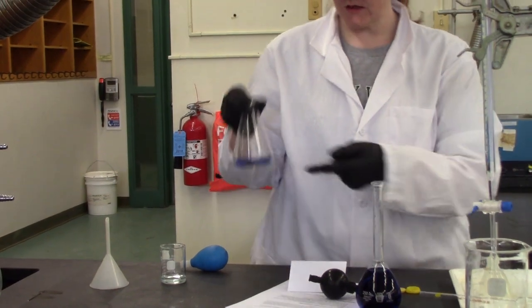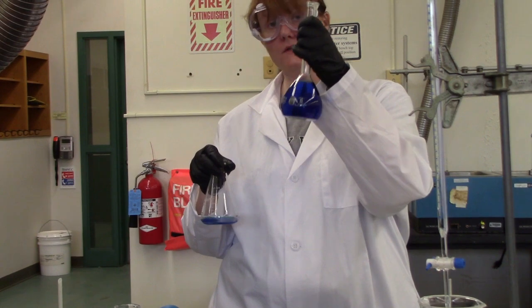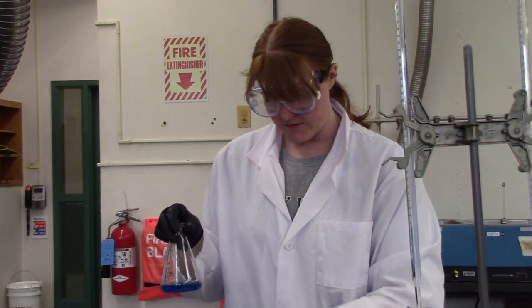When we do our calculations, it's going to be based on 20 milliliters of acid, not based on the entire 250 milliliters. We're not using all of this for each titration, so make sure you understand that. Okay, so we got our 20 mils of acid in here.